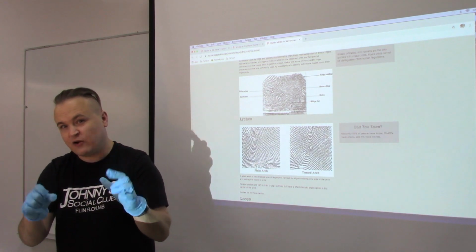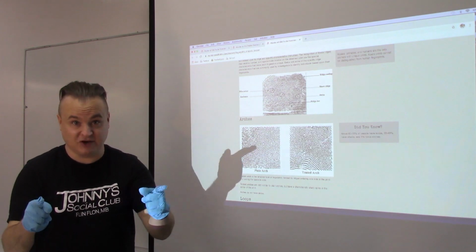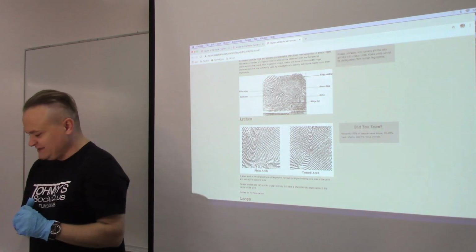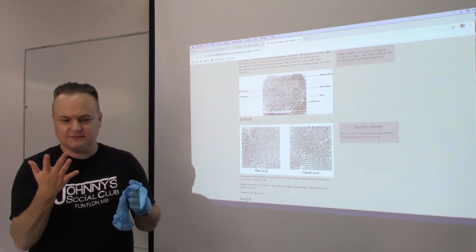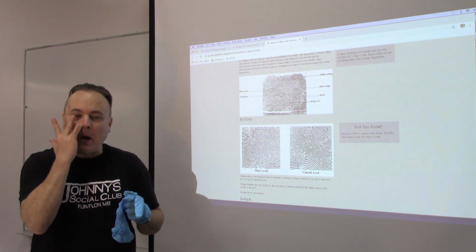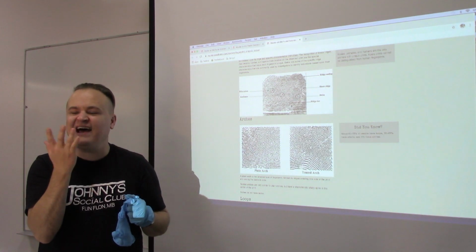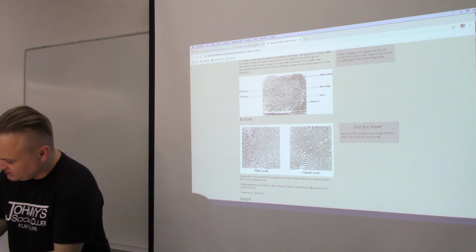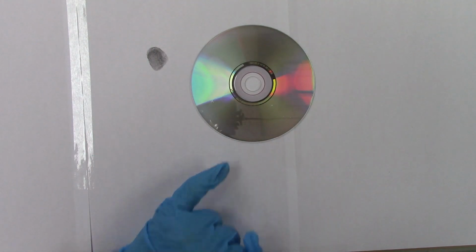You can take a picture of that, or you can do something called print capturing, and I'm going to show you how to do that right away too. So let's just look down here. First of all, if you want a good area to get some grease, generally like by your nose or your chin, you can touch that, and that's like cheating. It's like adding extra oil. I'm going to touch a nice shiny surface down here. Okay, I made a print on there.